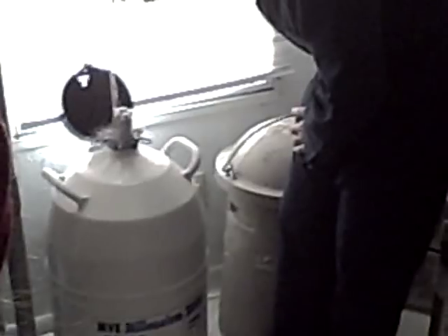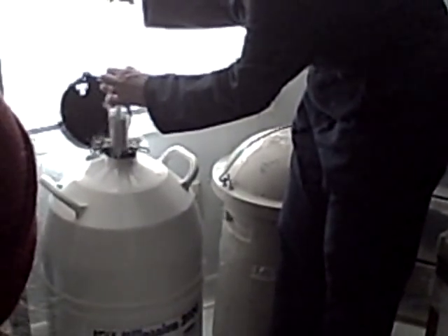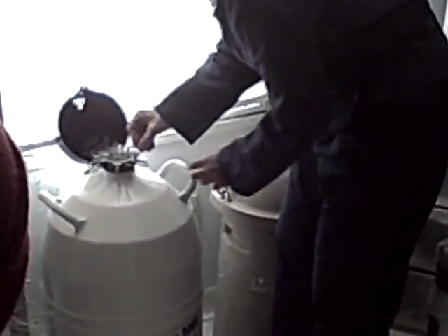These are where the semen is stored. This is called a cane. And on a cane are goblets. And the goblets contain straws.